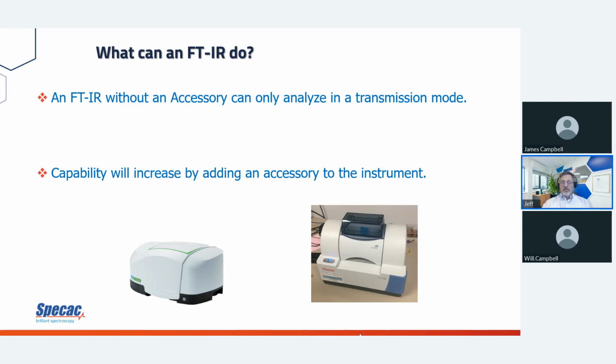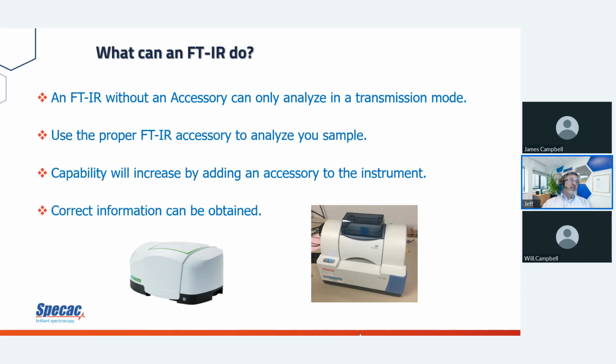You need an accessory. We're going to talk about a bunch of different accessories today. But using the proper accessory to get the data that you need easily, fast, and accurately is essential, so that the correct information is obtained.